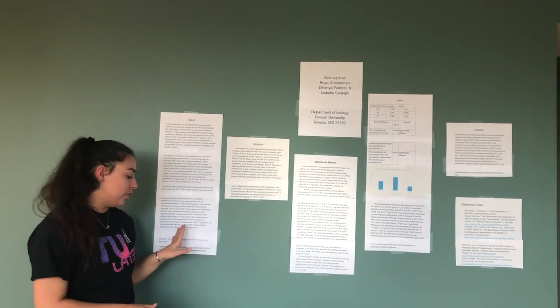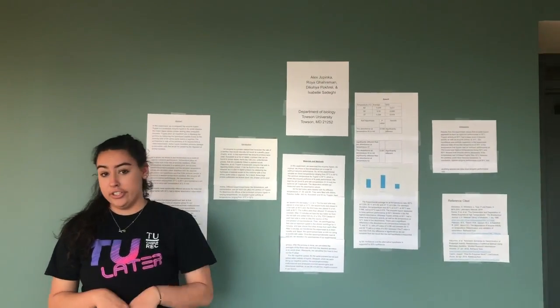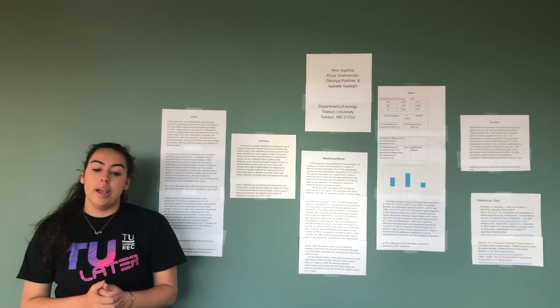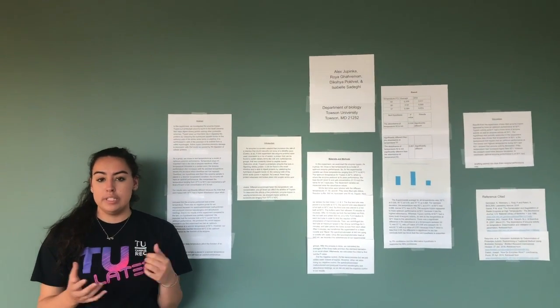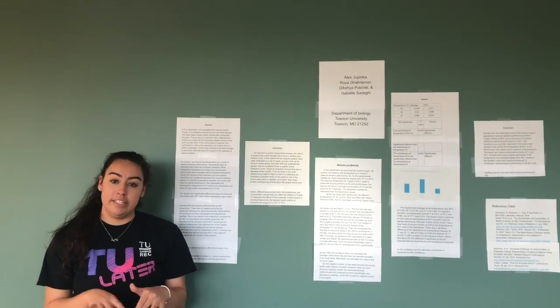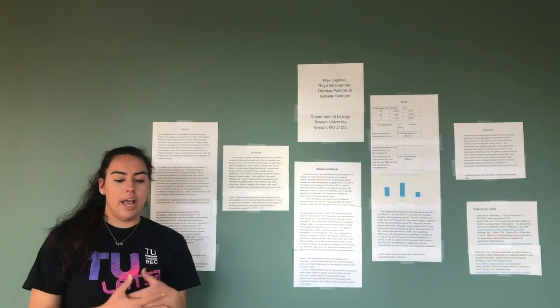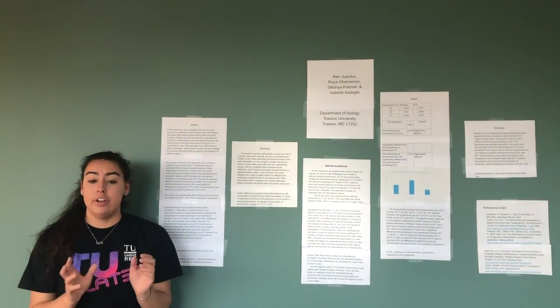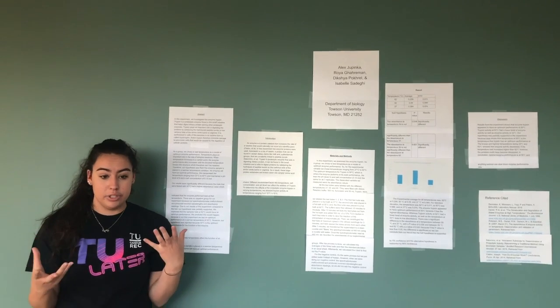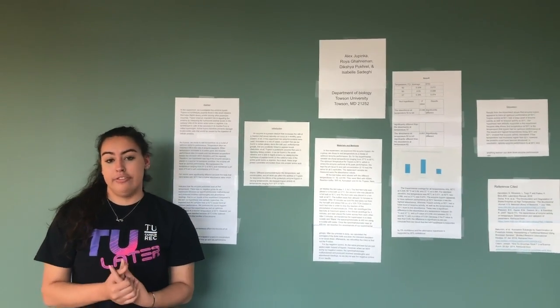In our lab, we have a question and hypothesis. Our question is, how does the temperature affect the function of an enzyme? And our hypothesis is, if the sample is placed in a warmer temperature, it will have optimal enzyme activity. Our rationale for our hypothesis is that enzymes have an optimal performance in higher temperatures because they increase the activity of enzymes and the rate of reaction.